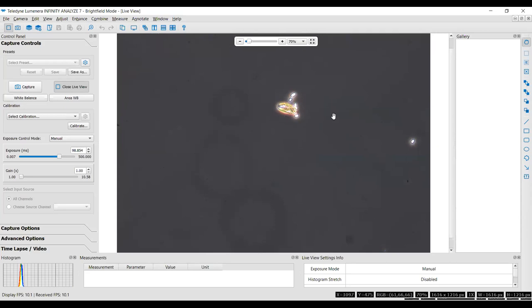This is Cryptomonas. So this is really nice. So you can see this one. It's got the parietal chromoplast. And then if you go down, here's one in girdle view, along with our only second representative of our funky filamentous friend. And this is in girdle view. So it's a bit of a rostrum.